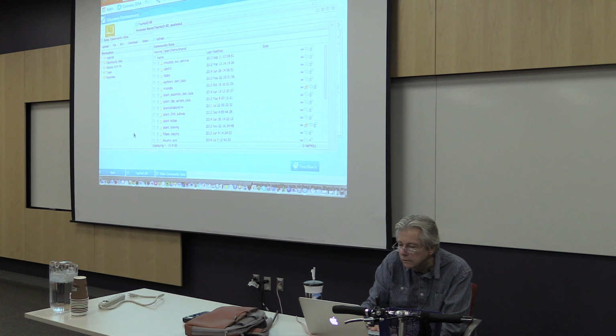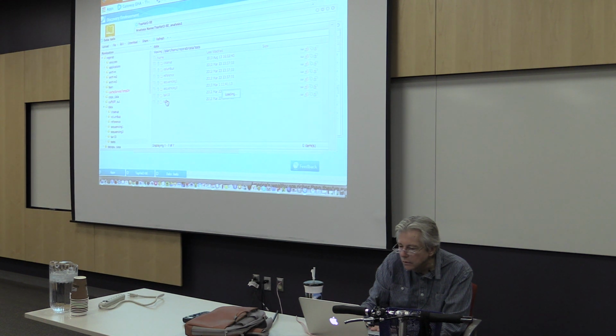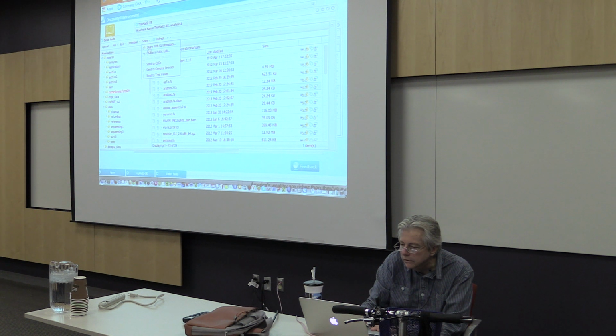And if it comes up at some point, if you want to share a file with somebody, like if I want to share one of my test files, again, just a quick review, I could just click this little box, click share, and this share with collaborators box will pop up, and I can look for collaborators, other iPlant users, to share within the discovery environment. Or you can create a public link. Just keep in mind that that public link is readable by everybody if you're really secretive about your data, and some people are.